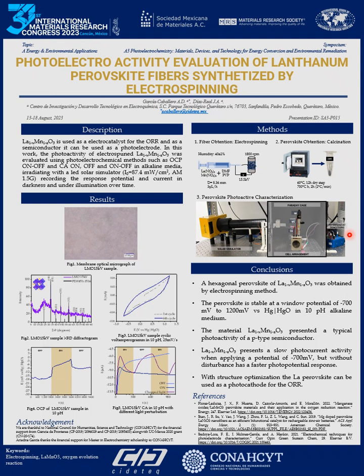And then we deposit this perovskite powder on a glassy carbon electrode surface to be evaluated in the setup that we can see here on the screen, where we can see the solar simulator in front of a Faraday cage that has a hole to let the light pass through and irradiate a 3-electrode set that has a quartz circle window to let the light pass and evaluate the perovskite. The results we obtained are here.